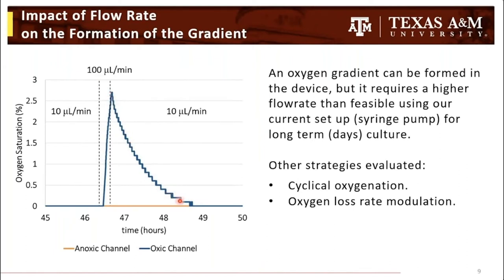So this result basically confirmed that an oxygen gradient can be formed in our device, but unfortunately it requires a very high flow rate. And this flow rate is not feasible for us using our current setup of a syringe pump for a long-term co-culture in the magnitude of days.